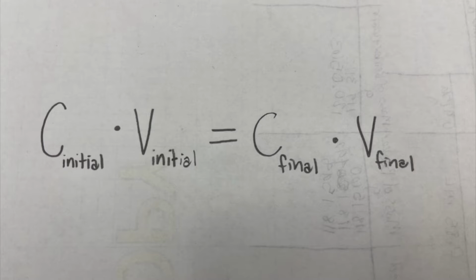Afterwards, add a specified amount of water to your original sample and record the new volume, which becomes our final volume measurement. Now that we have three of the equation's four variables, we can algebraically solve for the unknown variable. In this case, it's the final concentration.